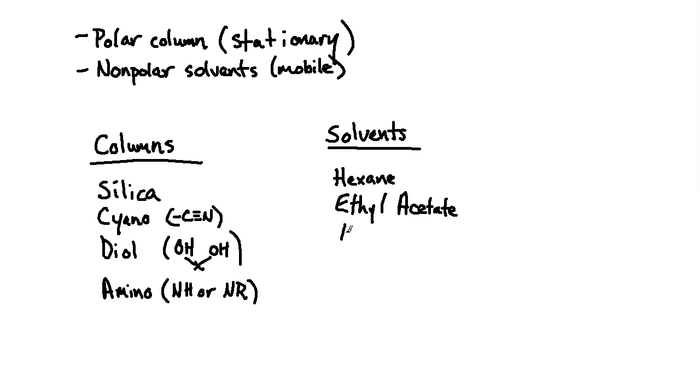Okay, another example is methylene chloride, sometimes referred to as dichloromethane, depending on the name that you're using. Okay, and chloroform could be ranked in here with this, but some of the chlorinated solvents offer good choices. You have to be careful when you're handling them, really all of these, but the chlorinated ones tend to have toxicity or carcinogenic concerns associated with them, right? So this, for example, would be CH2Cl2. Chloroform would be with 3 chlorines and 1 hydrogen there. But those do offer an optimal chlorinated solvent that's not too polar, but does offer a little bit of a polarity bump if you're mixing it in with some of the others.